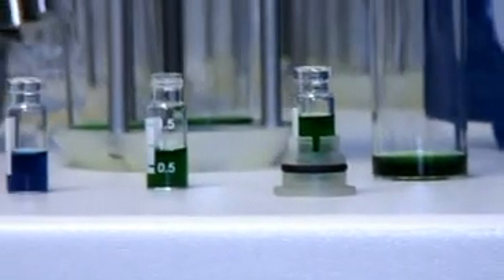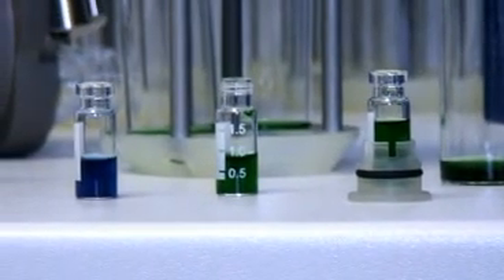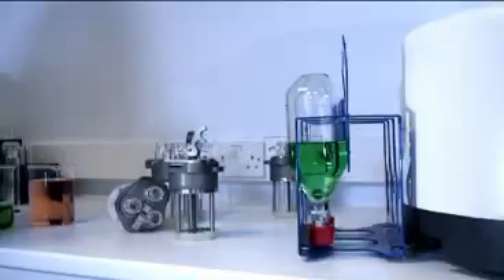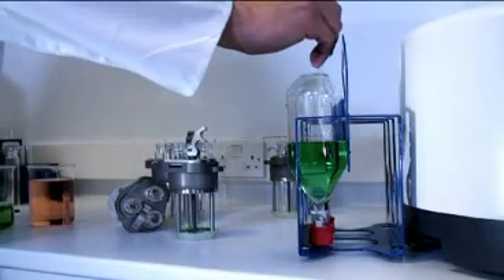If you need to concentrate your samples rather than dry them, the standard methods can be optimized by your local Genovac representative. The operator may also fine-tune the methods on the system. In some cases, the addition of a solvent keep is necessary to ensure the samples remain wet.